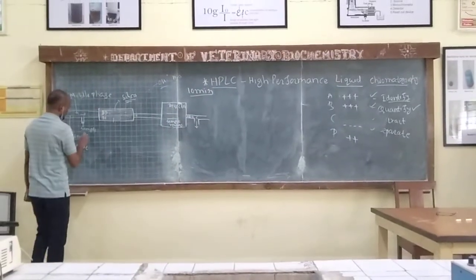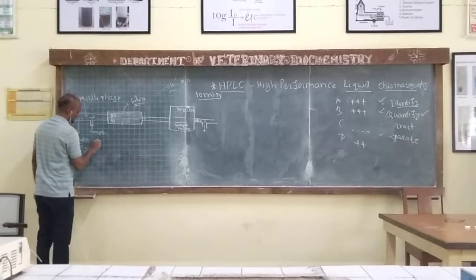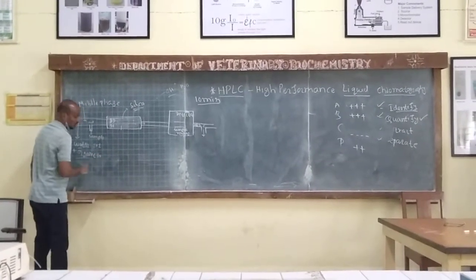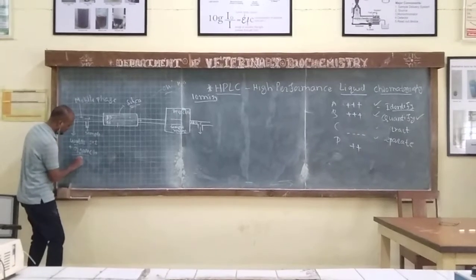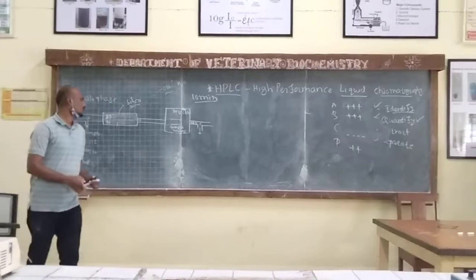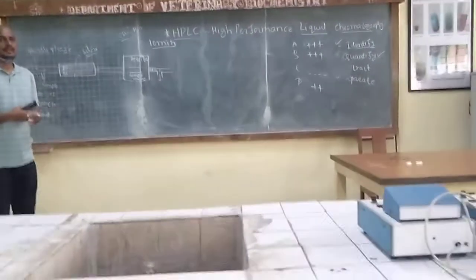So we have, for example, 90% water first and 10% organic solvent.